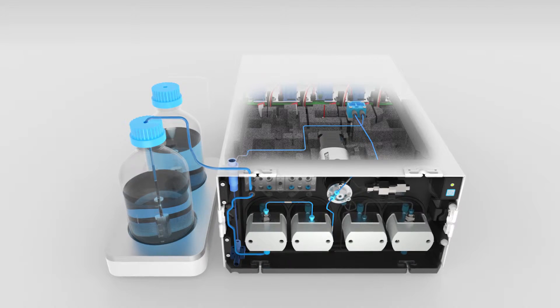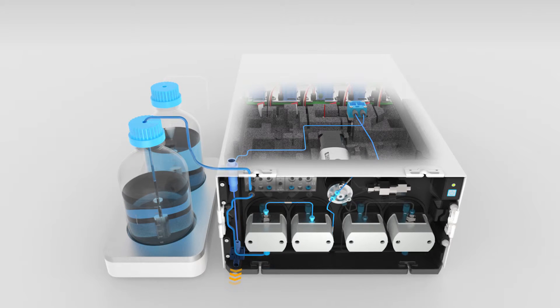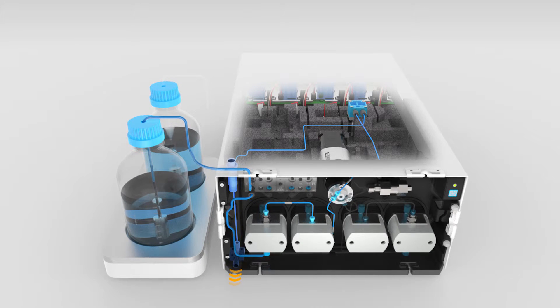Just press prime. Convenient and easy to use, the system is operational in less than a minute.